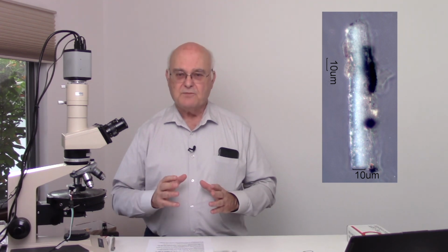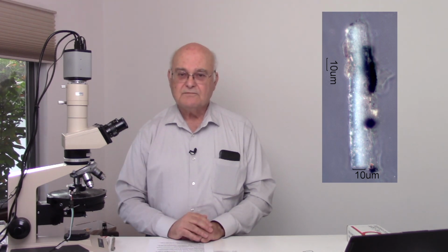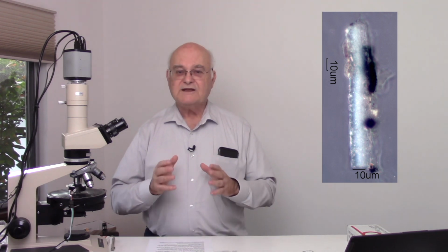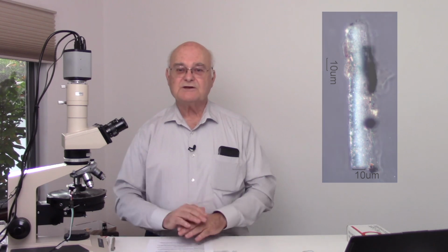These frothy particles, with reflected dark field illumination, are bright. Again, they are light scattering. That doesn't occur unless they've been exposed to high temperature. So there are a number of things that we can see in ash.